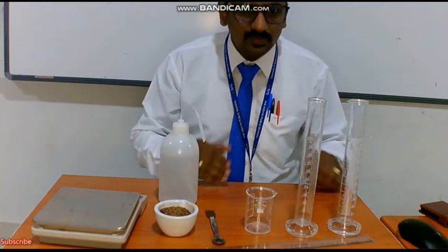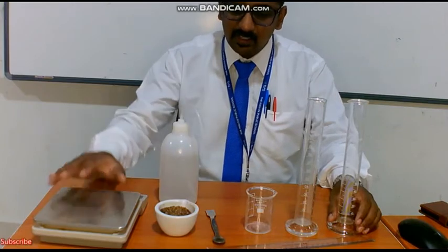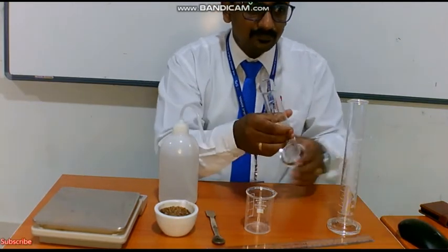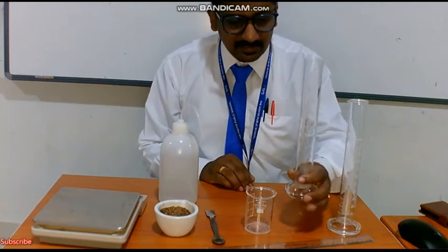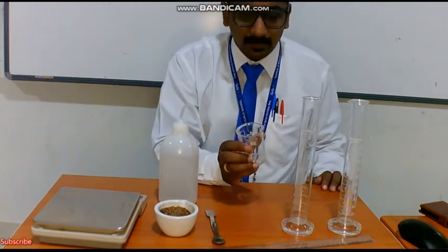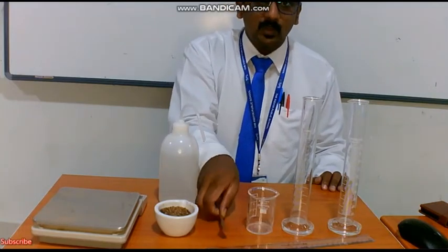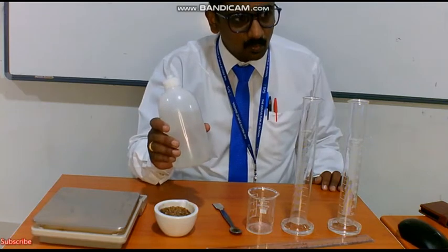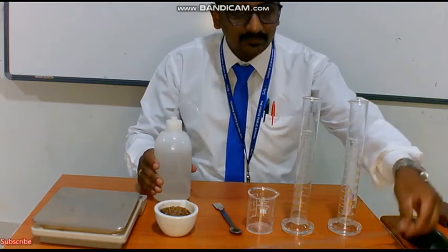I will run through the experiment and what we have to do. All we require is a weighing balance, a measuring cylinder for one soil sample, a beaker, a spatula, a wash bottle, and a scale.